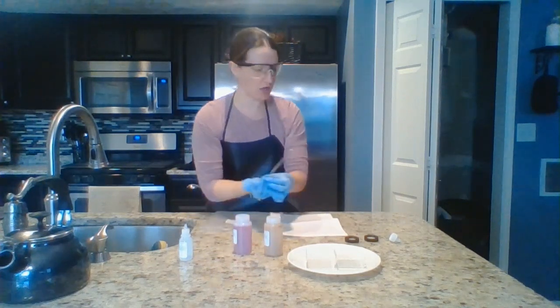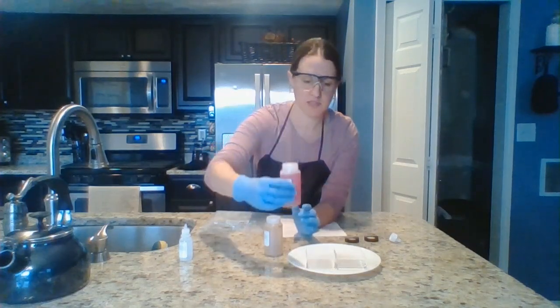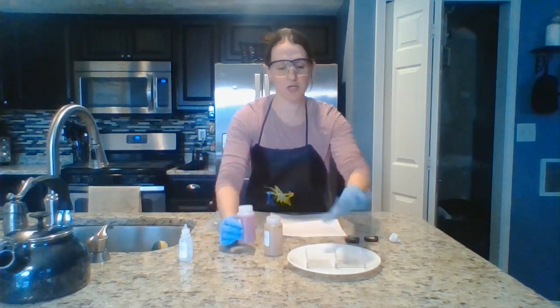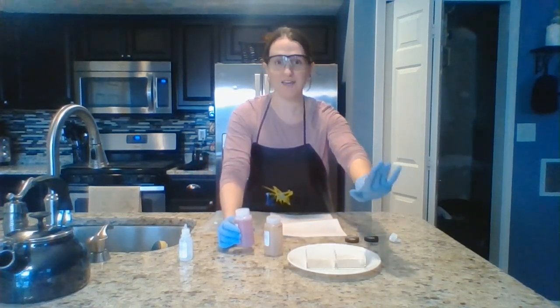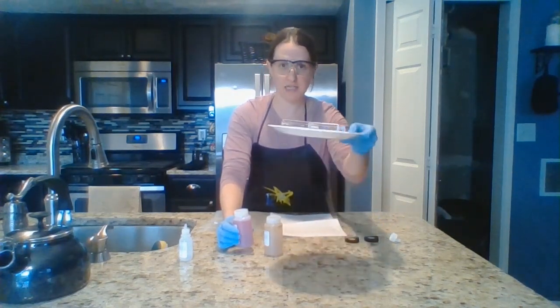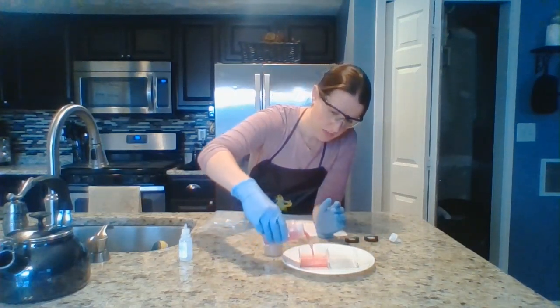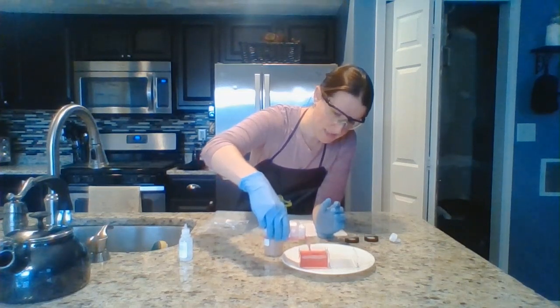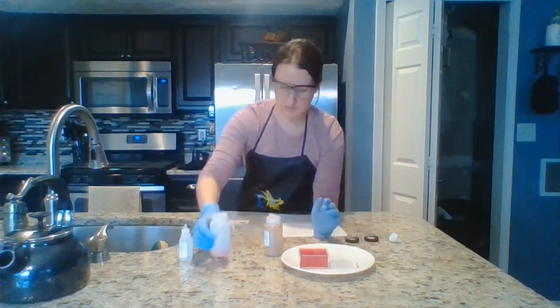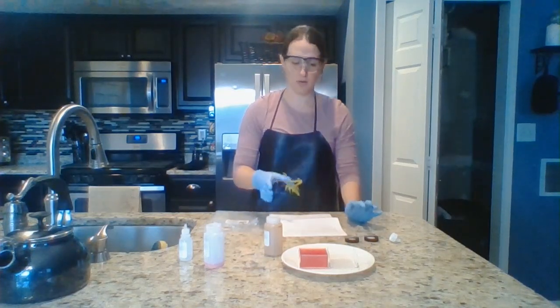Lastly, once you have your pink color and it stays pink, we'll gently pour all of this liquid, or almost all of this liquid, into the plastic mold. You want to fill it all the way up to the top, and then we're going to set our mold somewhere safe and to the side so it can set overnight. If you have leftover liquid in your bottle, that's okay. And then we'll let that sit for 12 to 24 hours.